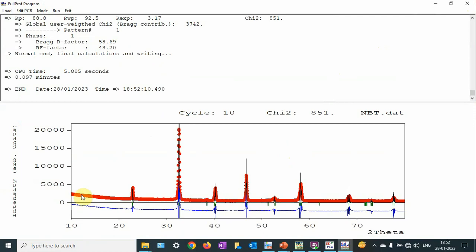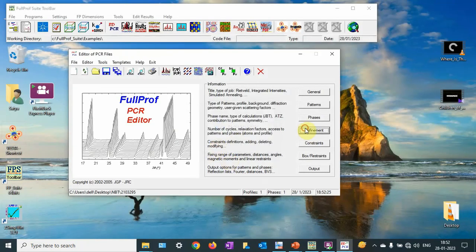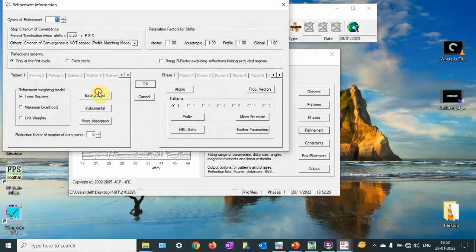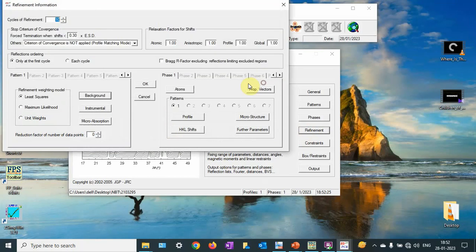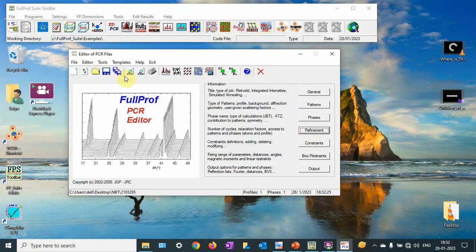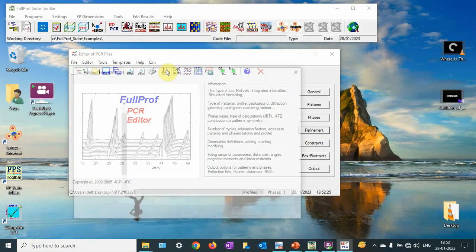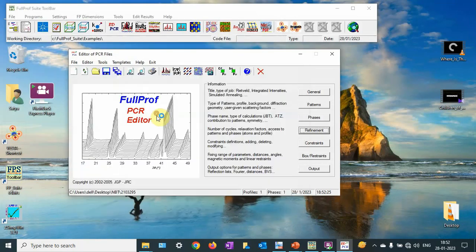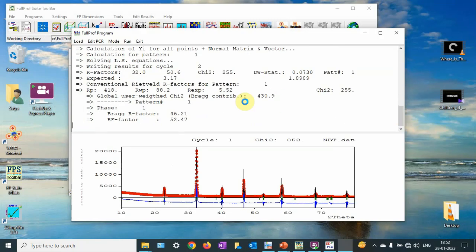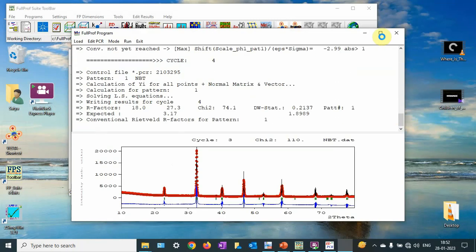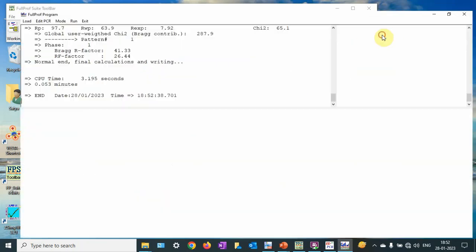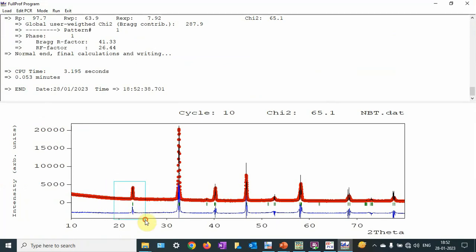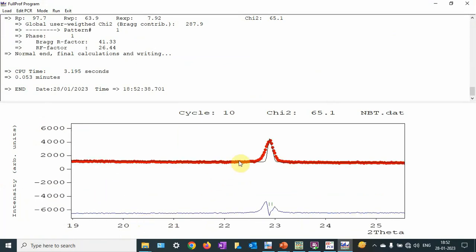Now the backgrounds are not at the same height, so we are going to refine the background next. I will do the background refinement. You can see that the background is getting adjusted and here the background is fitted well.